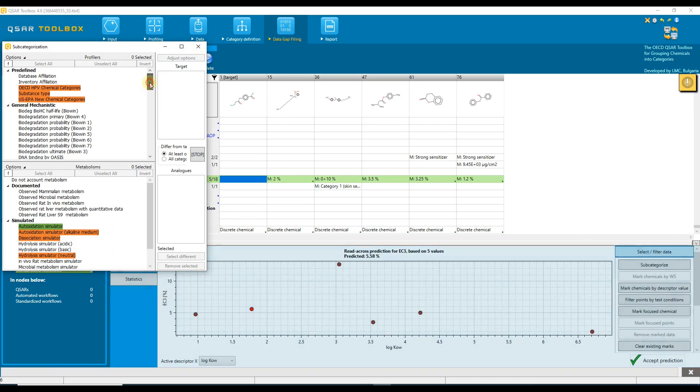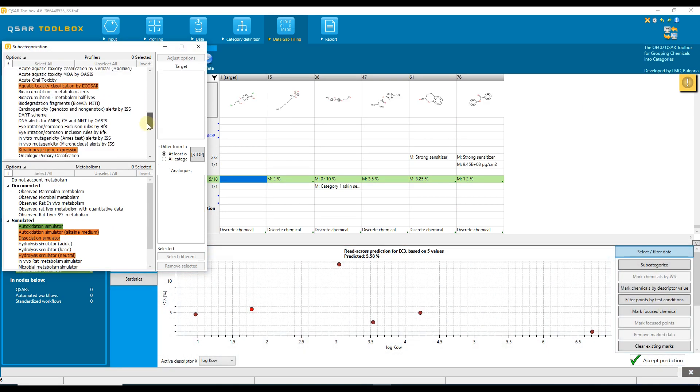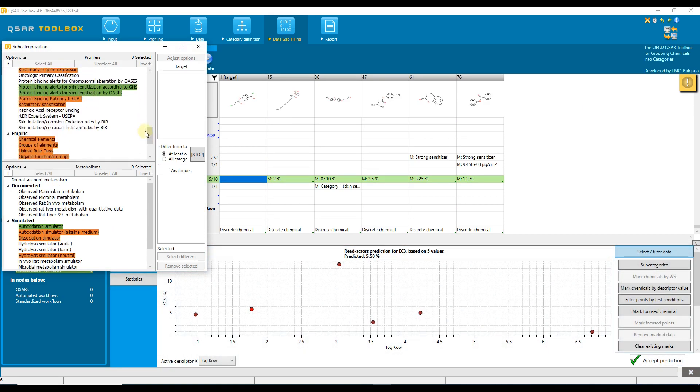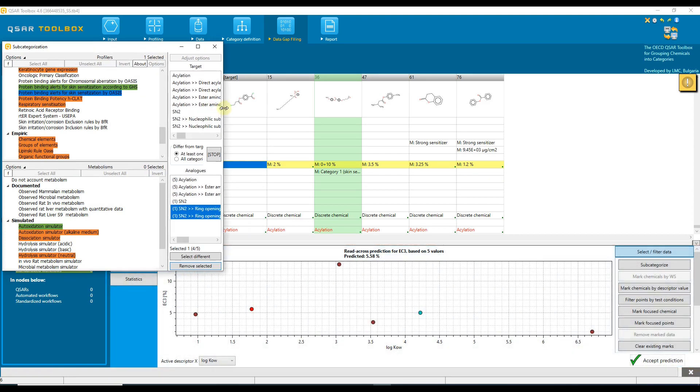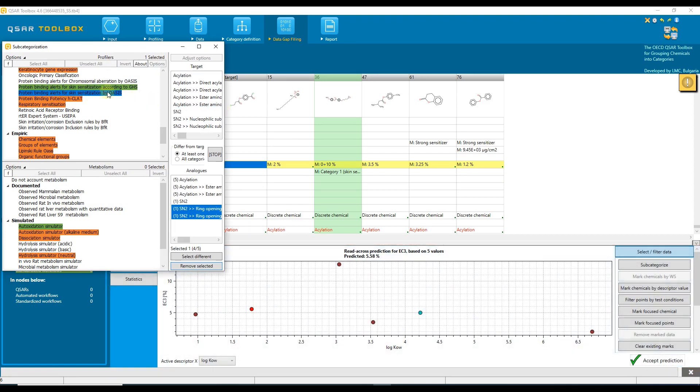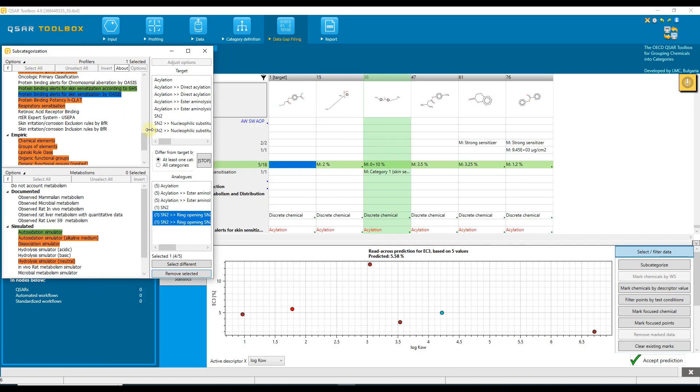Now, we are going to use a mechanistic profiler associated with the target endpoint, and this is the same one we used to create the primary group. Select protein binding alerts for skin sensitization by OASIS. For primary grouping, we did not select the strict options.